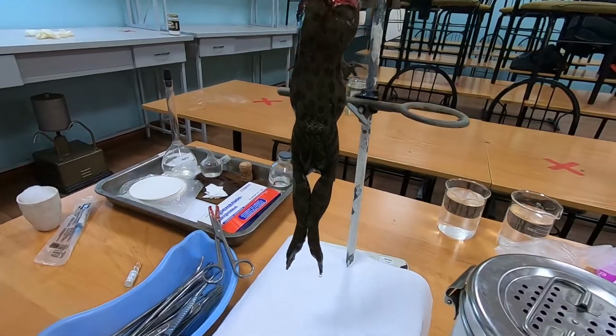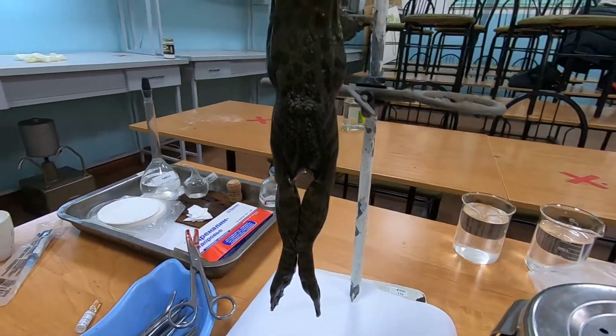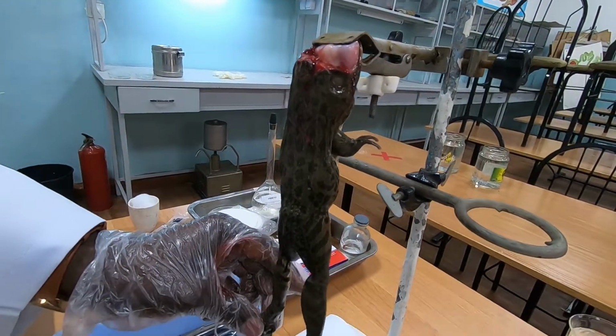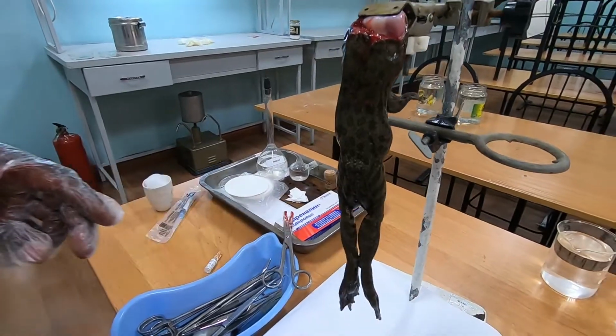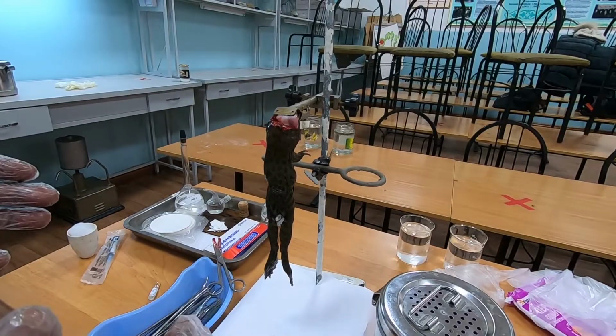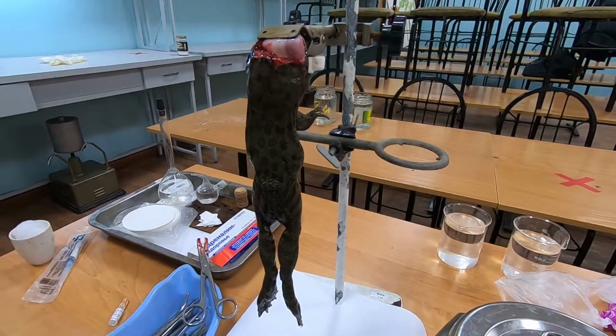Can you see it now? The frog is hung. It is still in a very shocking condition. So we leave it like this. It is not yet dead, but it's in a shocking position now. So after some time, it will regain its sensitivity.